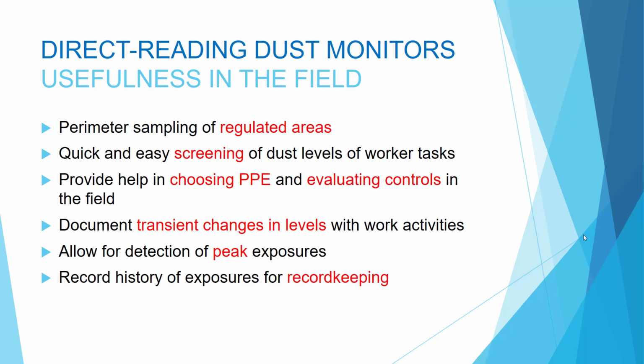These direct reading dust monitors do have usefulness in the field for things like perimeter sampling of regulated areas, quick and easy screening of worker tasks, help in choosing PPE and evaluating controls in the field, documenting transient changes in levels with work activities, detecting peak exposures, and recording history of exposures for record keeping.